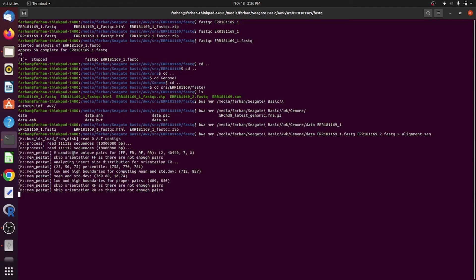The next step will be to sort and convert SAM into BAM. Thank you.